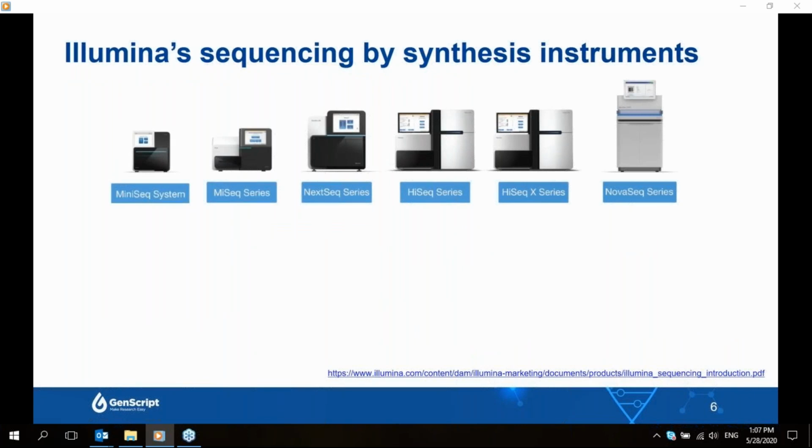As I will focus on Illumina platforms today, I'll briefly introduce it. Here is a lineup of Illumina sequencers. Some are outgoing, but they vary in size and amount of sequencing data they generate. But all instruments use the same underlying chemistry, which is very similar to Sanger sequencing and called sequencing by synthesis. Very quickly, it starts with NGS library preparation, a process that attaches specific sequences to the DNA sample so that they can be amplified and subsequently read by the machine.